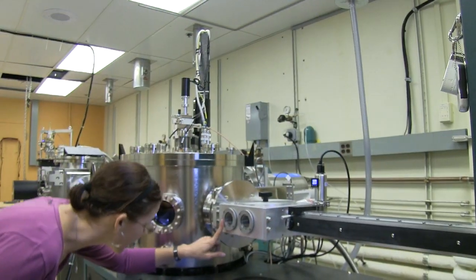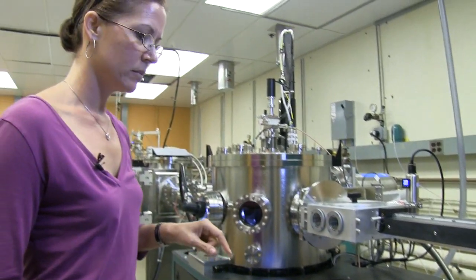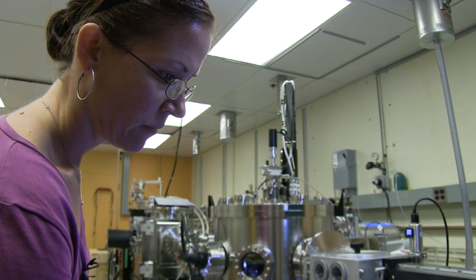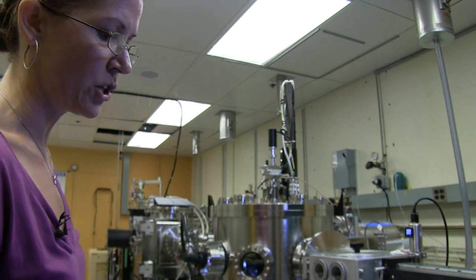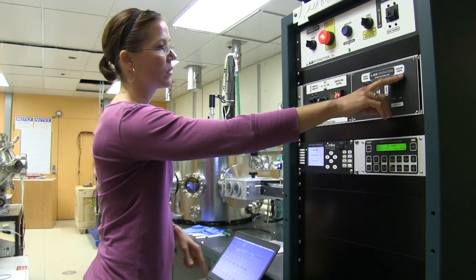So now you look in here — the sample holder is back in here. A very, very important part of this is to make sure you close the transfer valve again. Otherwise, you mess up the pressure in the main chamber. I'm double checking that the transfer valve is closed.